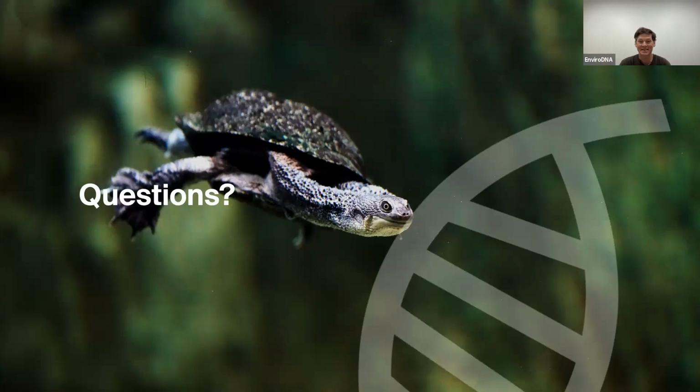Well, the list is really only limited by imagination. The common ones are the ones you mentioned. So obviously water, actual samples of an animal, if that's feathers, fur, secretions, scats, that kind of stuff. Also just sampling terrestrial environments. For instance, if you can use some ecology and some knowledge of that species to really target something, it sounds like you're in a targeted species context, then sampling likely habitats is really useful.